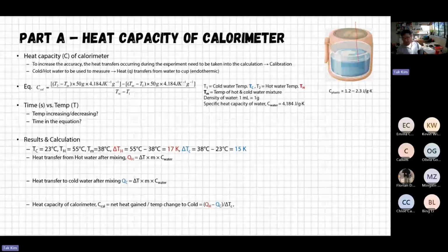By putting a thermometer, you can measure changes of the temperature, because most of the heat from a reaction or from putting hot water into this system, you should be able to see as changes in the temperature, but a certain amount of energy will go on to the surface of the calorimeter.